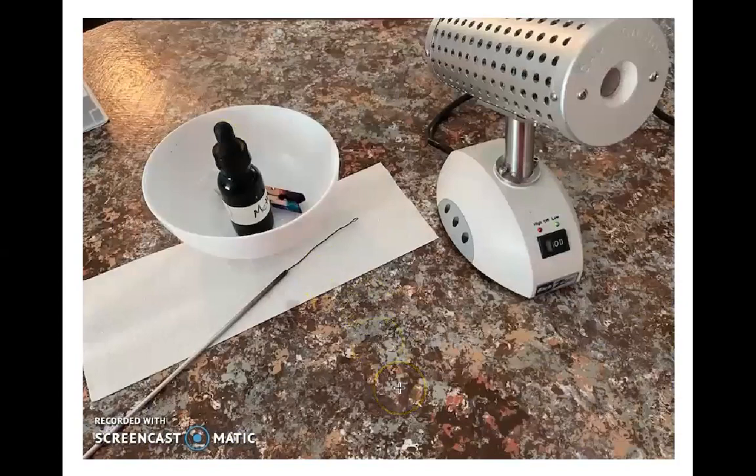Okay, so I've gathered the supplies that we're going to need today in order to make a smear of bacteria for staining. And what you're seeing on the desktop here, I've got a bowl that is used only for staining purposes. I've got a dropper bottle with methylene blue in it, which is a very commonly used simple stain. I've got a clothespin here, and I'll show you what we do with those while we're staining.